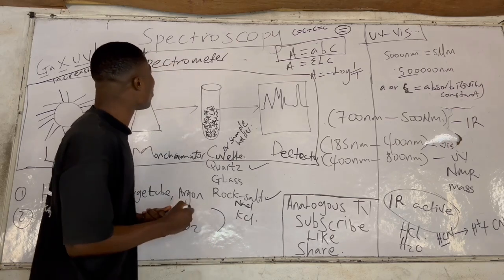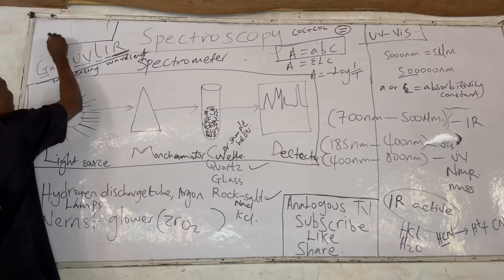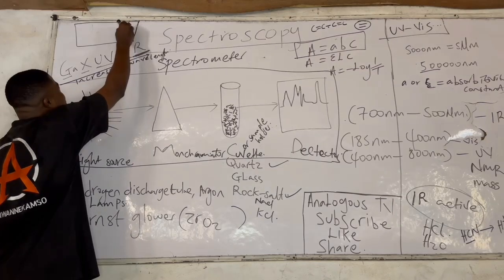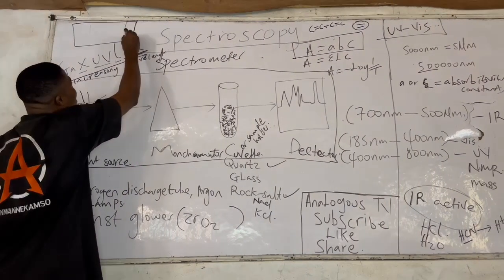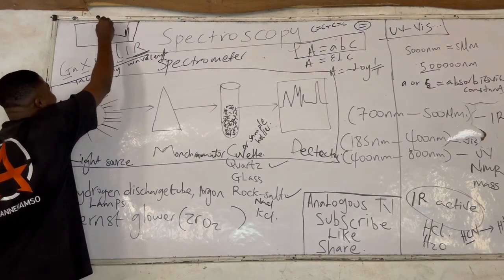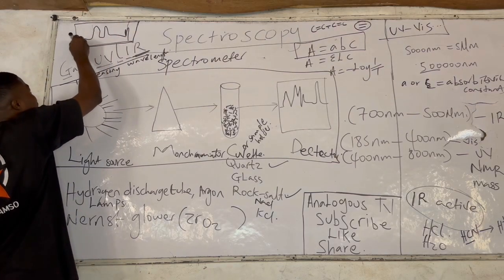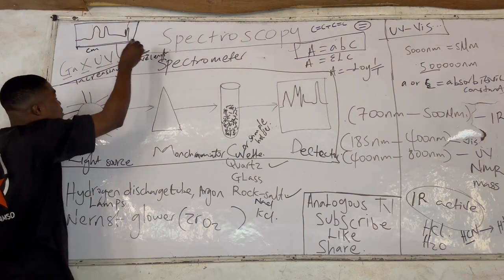For an IR spectrum, the spectrum is usually something like this, and we see the presence of functional groups, we see their relative peaks, their abundance. Each unique peak is in centimeters, or in nanometers, as the case may be.